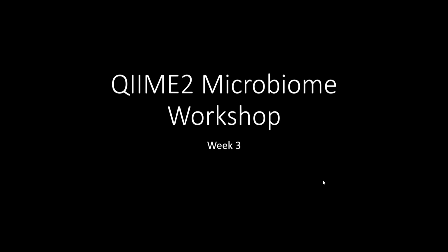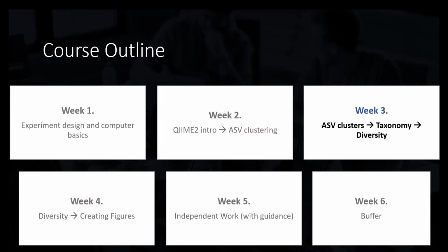In week 3 we're going to be going from the ASV clustering, so making those groups of organisms from the sequences, to determining the taxonomy and measuring diversity. Specifically, I'm going to talk about first, how are we actually going to record our steps if we want to show somebody what we did in a publication or something like that? How would we go about logging that?